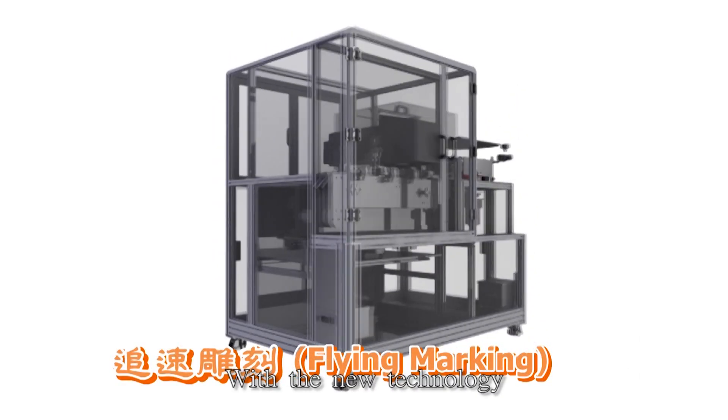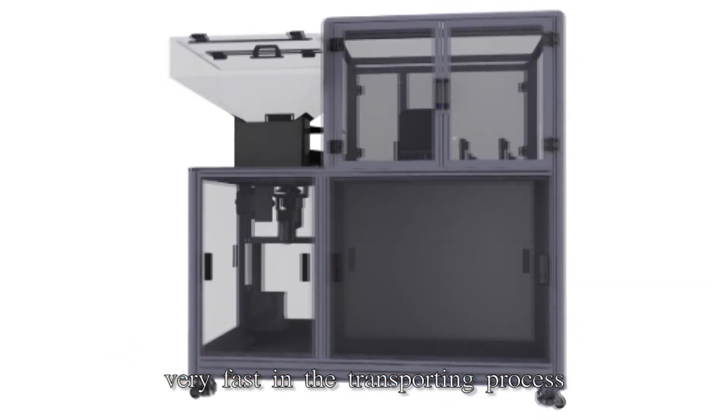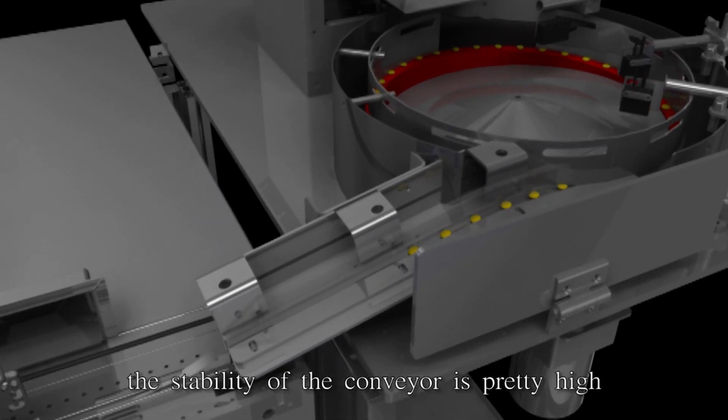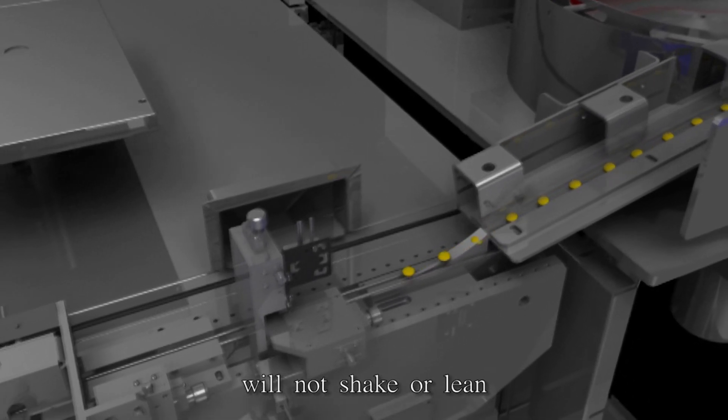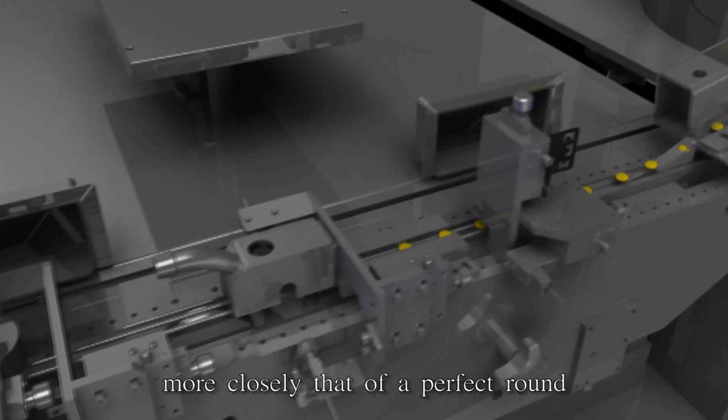With the new technology of flying marking, Yuan Cheng can punch the tablet very fast during the transporting process. Thanks to the advantage of fast punching, the stability of the conveyor is high, so the tablets will not shake or lean and the hole shape is more closely that of a perfect round.